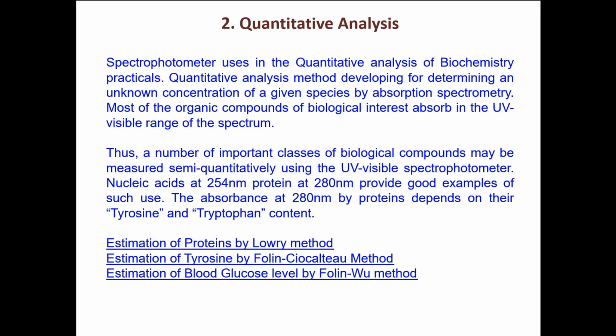That means with an interval of 20 seconds. So the first 20 seconds, at 0th time, it is 0. At the 20th second, there is a reading of something like 0.2. And then the next one, that means the next 20 seconds, that is 40 seconds. At 40 seconds, it is like 0.4. And next is 60 seconds, right?